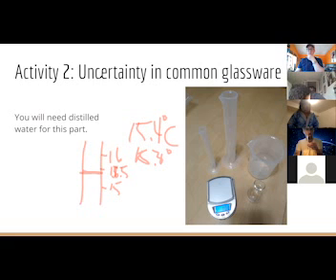So that's why we'll be working with partners. Generally, they will both look at either the temperature or the volume in something, and then they'll take an average of what they both report, because that's probably closer to the truth. But all three of these digits are significant. The 15 is significant, and the 0.4 is significant. And remember, the 0.4 is an estimate that I made. And that's true of any sort of measurement. Generally, the last digit is an estimate, but it's still a significant figure.